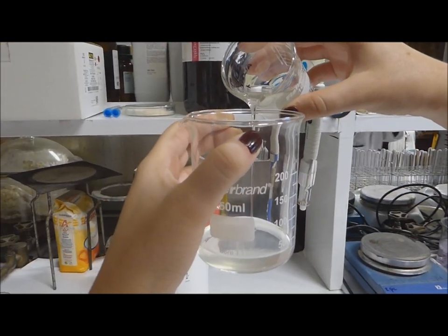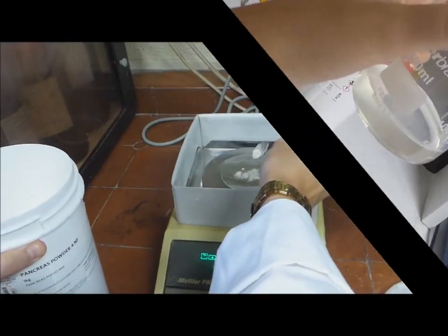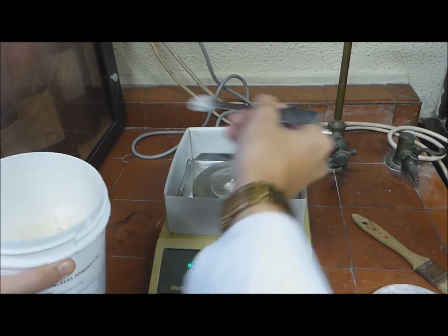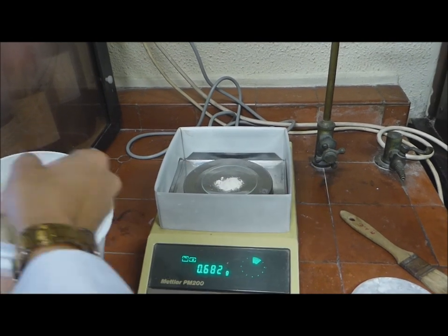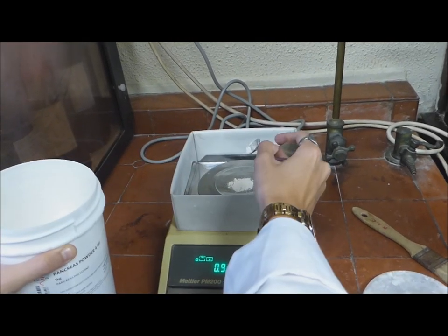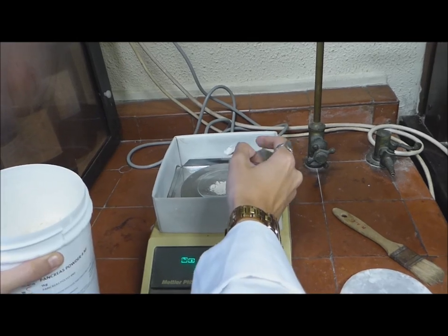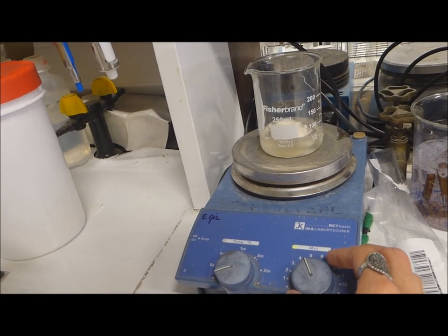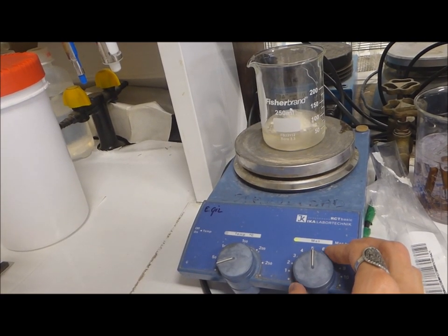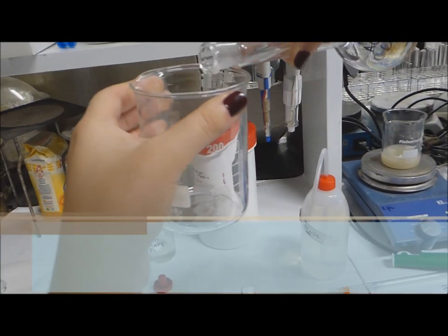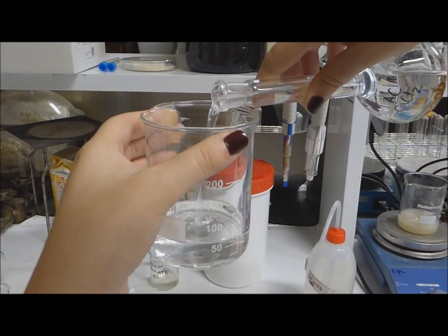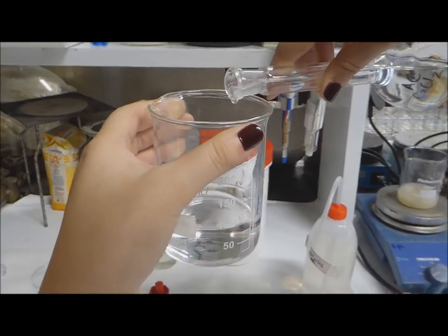We take 50 milliliters of sodium alginate and we pour it into a 250 milliliters tumbler. We add one gram of pancreatine and we shake it with a magnetic agitator until total dispersion. In another tumbler we put 100 milliliters of calcium chloride and we keep it on shaking.